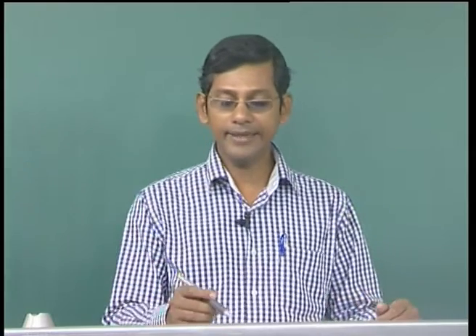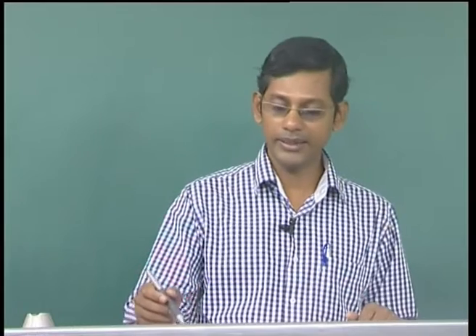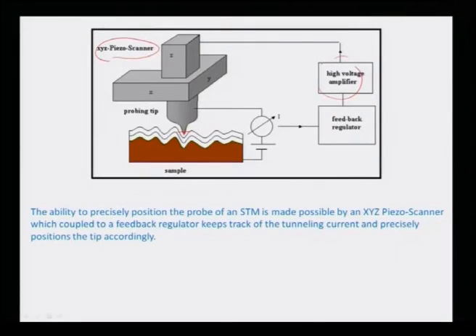So if you want to keep this tip at a constant distance from the sample surface, there is a feedback loop. You need a voltage amplifier also to amplify whatever voltage is being recorded. The ability to precisely position the probe of an STM is possible only because of the XYZ piezoelectric scanner, and this XYZ piezoelectric scanner took a long time to become operational and to be used for this kind of microscopy purpose.